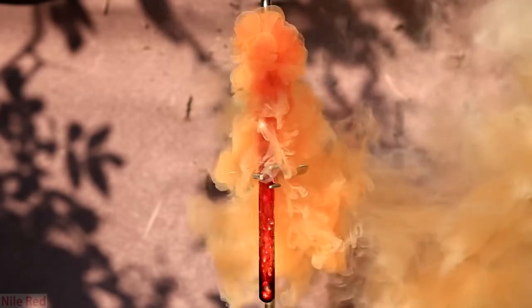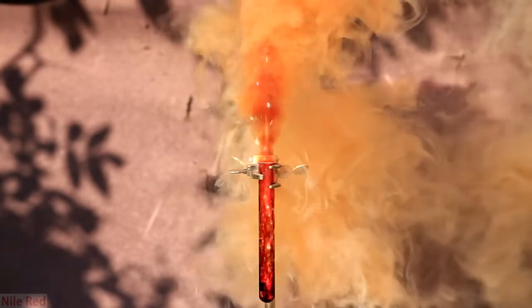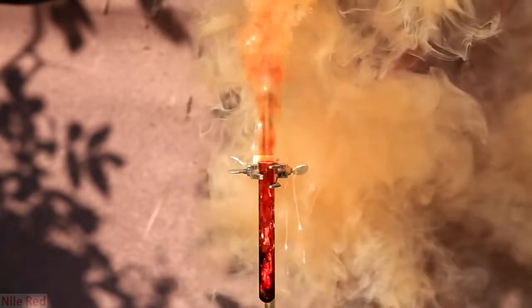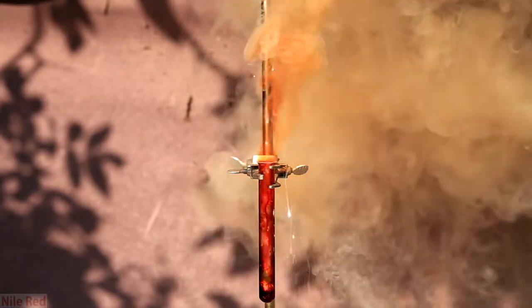When slowed down to about 1/4 the speed, you can actually see a molten red-hot ball of aluminum bouncing up and down the test tube. The white pieces that you see flying out of the test tube is actually liquid aluminum.